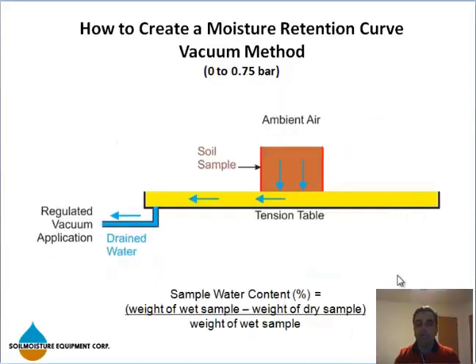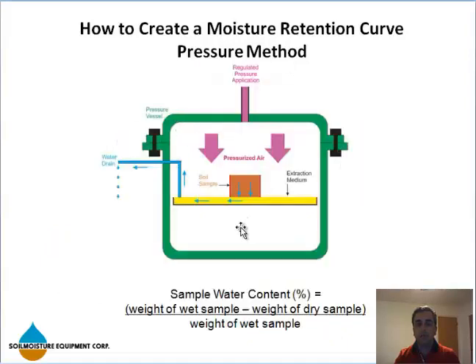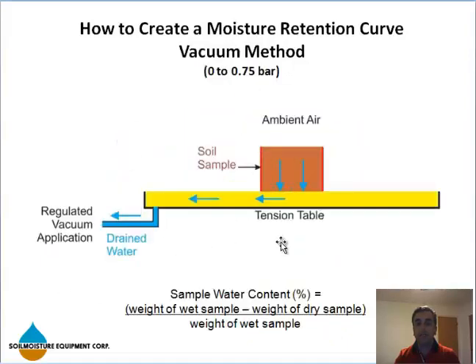In this slide, you see a vacuum method. A vacuum method is very similar to a pressure method, except that, so this is the pressure method and this is the vacuum method.